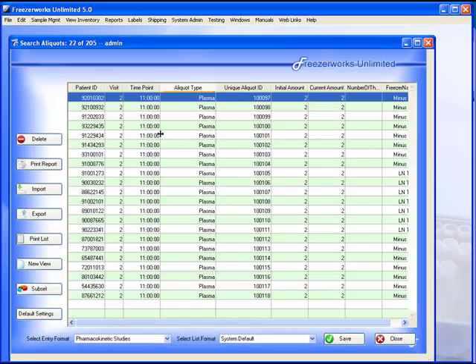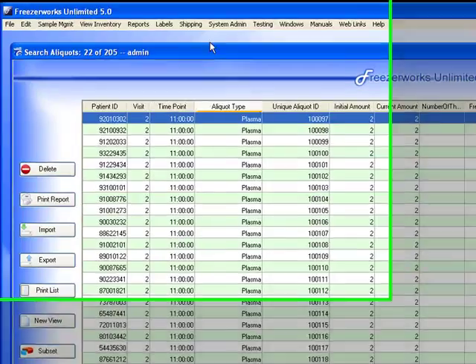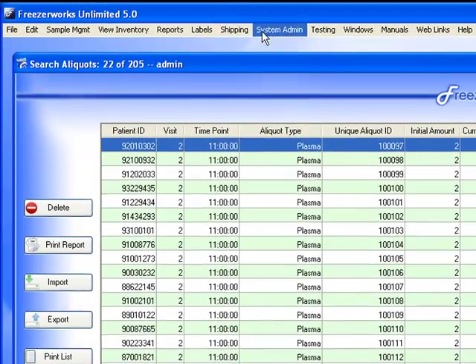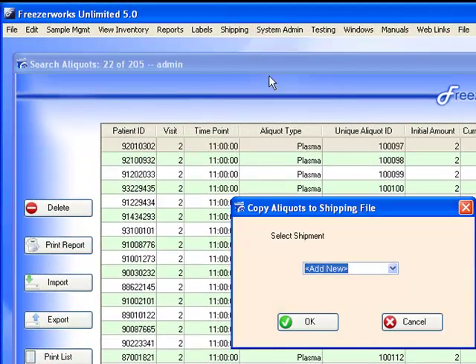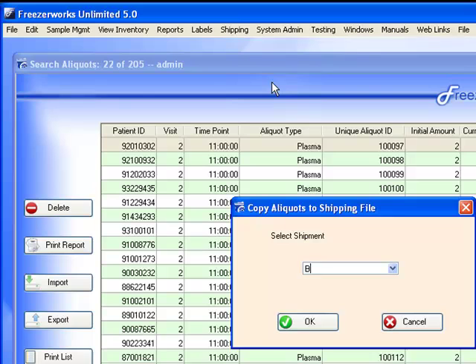Now, let's mark these aliquots for shipping to Dr. Barton. We go to the shipping file and select Copy. Here we can give the file a name. For example, Dr. Barton with the date.